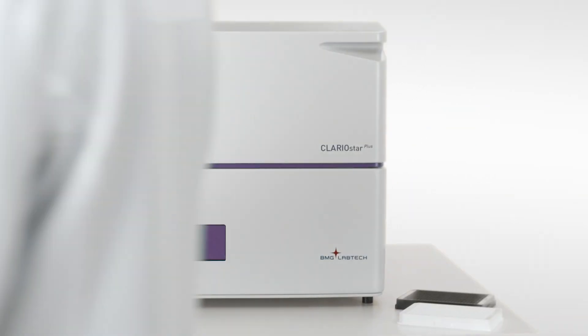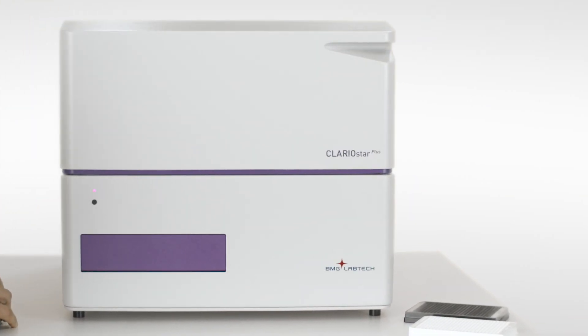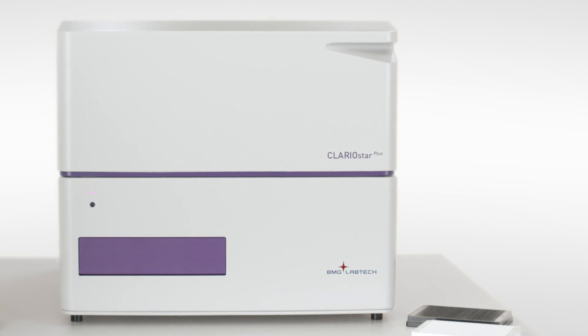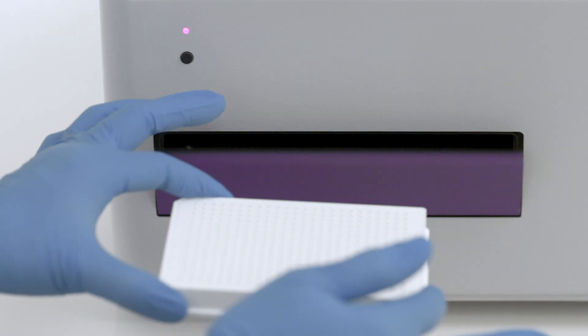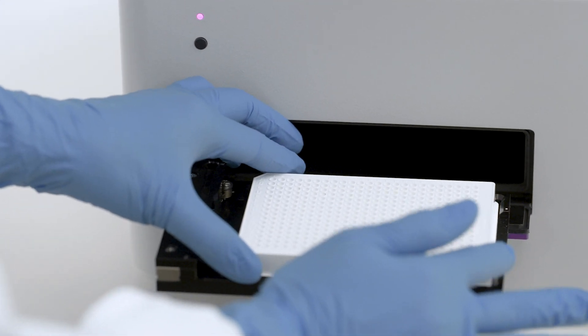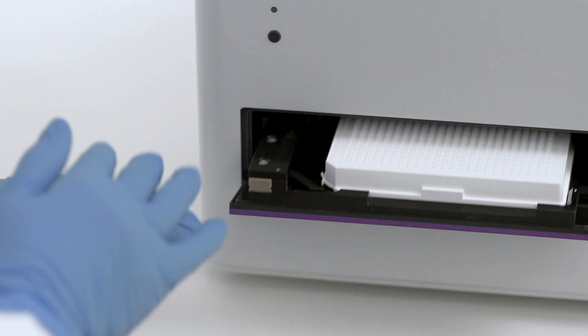The new ClarioStar Plus is a high-performance, multi-mode microplate reader that fits the current and future needs of your laboratory. Flexibility, combined with the highest sensitivity in its class, makes the ClarioStar Plus the most versatile instrument for all laboratory applications.